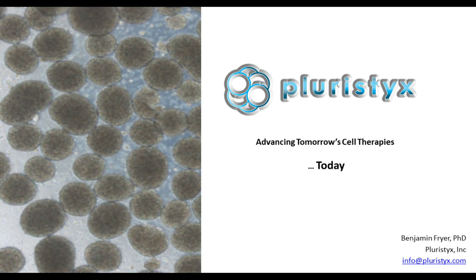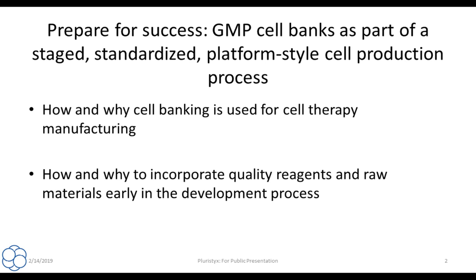Thank you, Ms. Valdez. I'd like to thank Ms. Valdez from LabRoots and also Kyle Berry and Amanda Summers from Thermo-Fisher Scientific for the opportunity to present here today to all of you. So today, as was mentioned, I'll be talking about manufacturing GMP cell banks as part of a staged process and why it is so important and how that's incorporated into cell therapy manufacturing. And we'll also talk really about the critical reagents, maybe most importantly, the quality of the reagents and raw materials, also known as ancillary materials that have to go in early in the development process, and why it is so important to incorporate quality materials early on.